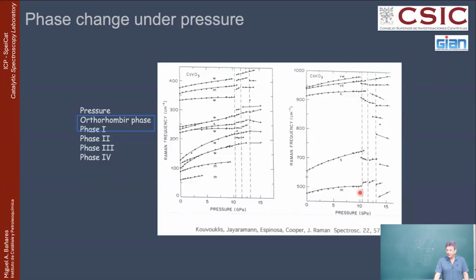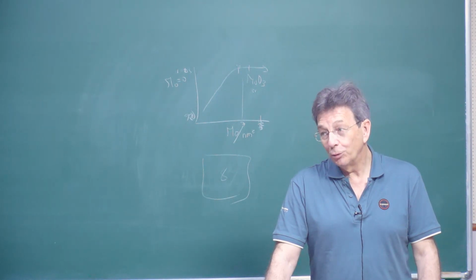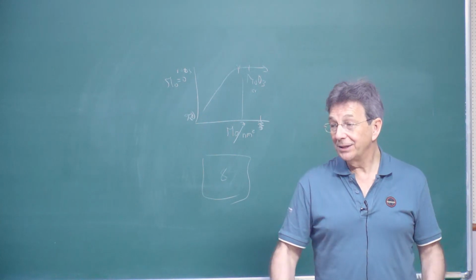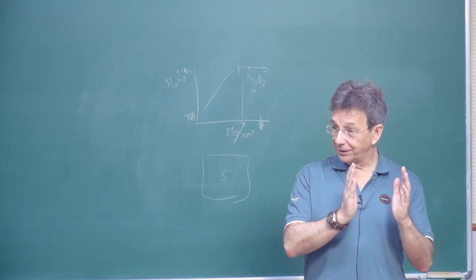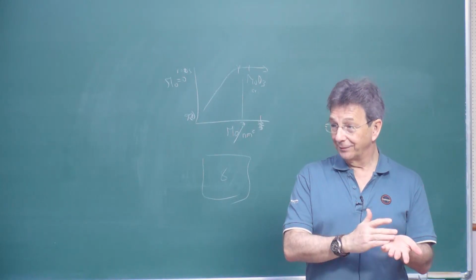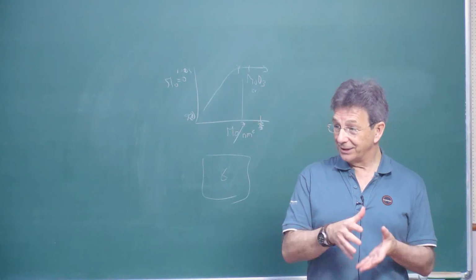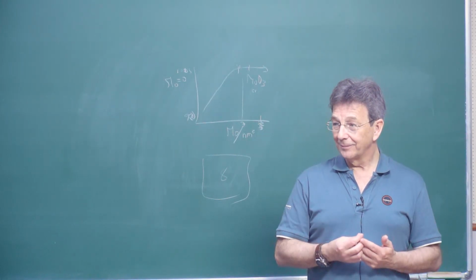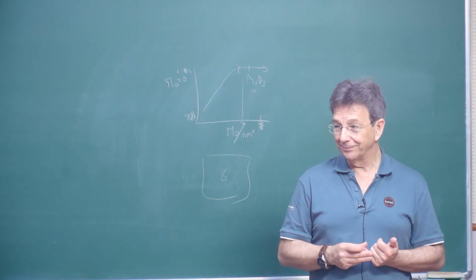You can, as long as it is big enough to generate an X-ray diffraction pattern, because otherwise you will not be able. And if you're looking at a material which is not crystalline, you won't be able to see that in X-ray. So these kind of things you can see with X-ray, indeed, because there will be a shift in the diffraction pattern associated with the bond length. But in this case, even with amorphous material which is suffering under pressure, you can tell. Or if you're dealing with crystallites below 3-4 nanometers, you can also see.